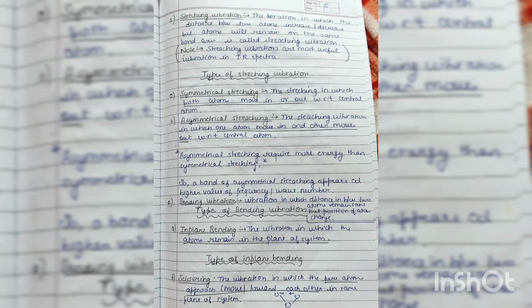So, types of stretching vibrations. First, symmetrical stretching. The stretching in which both atoms move in or out with respect to the central atom. Second, asymmetrical stretching. The stretching vibration in which one atom moves in and the other moves out with respect to the central atom. Asymmetrical stretching requires more energy than symmetrical stretching. So a band of asymmetrical stretching appears at higher value of frequencies or wave number.